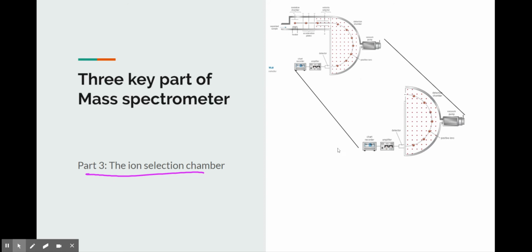And we can see that that magnetic field begins to cause this thing to travel in some sort of circular path with a known radius. And if it does that known path with that known radius, you'll notice that it winds up hitting this detector. So this is the path of the particle, travels from here to here, hits the detector.